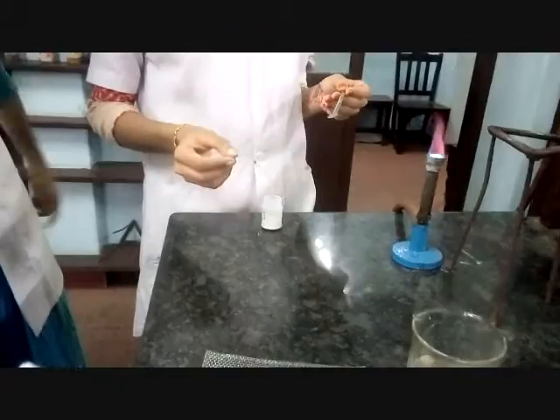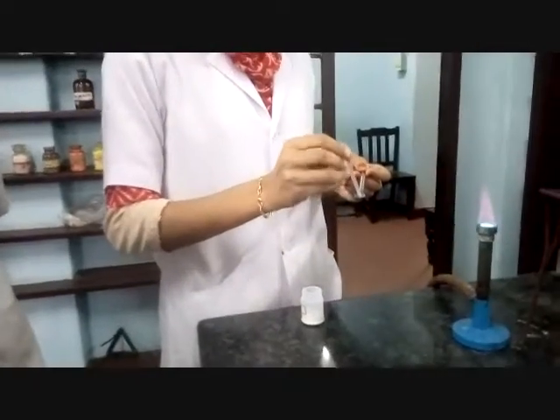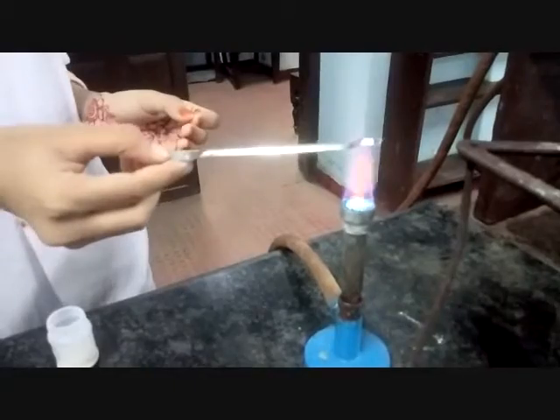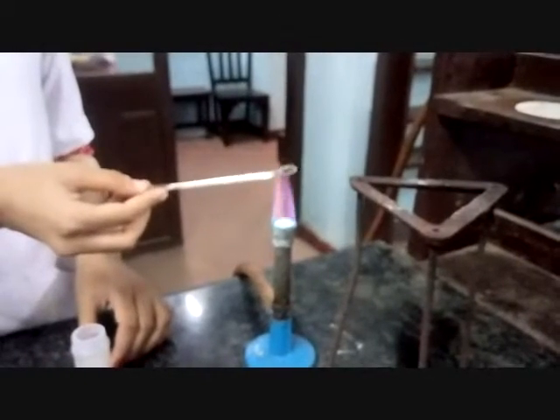Now functional groups. Test to find out whether the compound is aliphatic or aromatic. Ignition test. A little of the substance is burnt on a nickel spatula. Burns with a non-smoky flame, the compound is aliphatic.